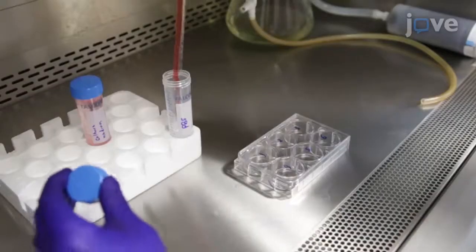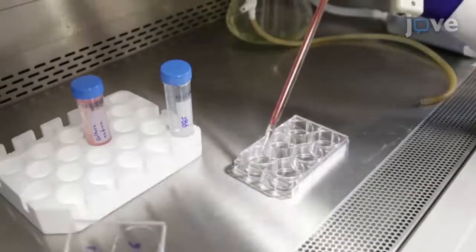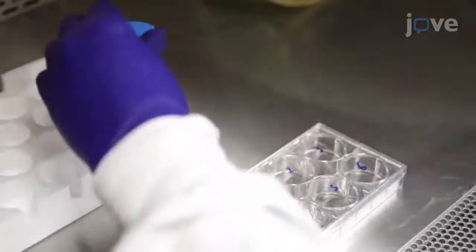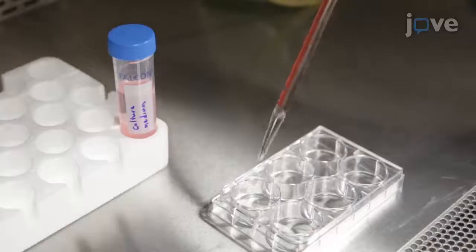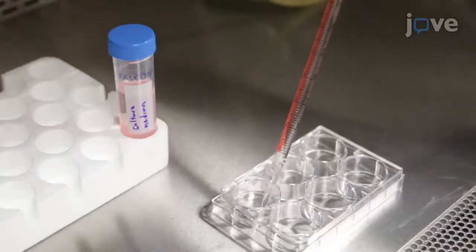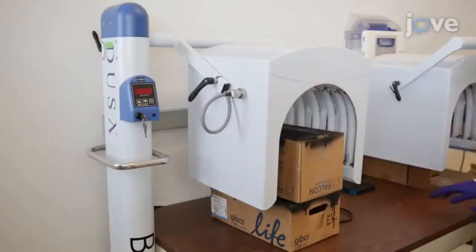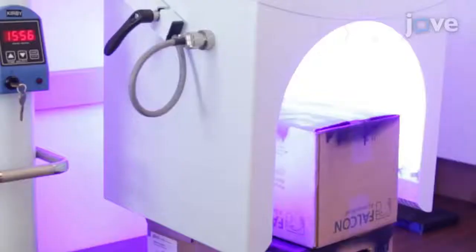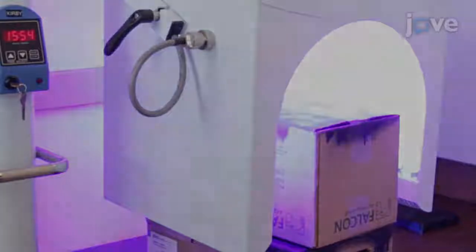At the end of the incubation, wash the cells in each well with 2 milliliters of PBS and refresh the cultures with 2 milliliters of fresh culture medium for blue light irradiation. Before irradiating the cells, warm up the blue light device at a 417 nanometer output wavelength for one 1,000 second cycle.